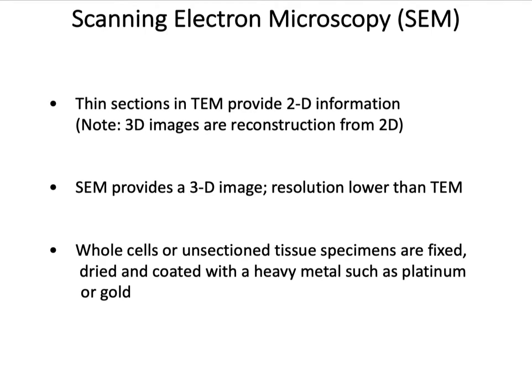As I mentioned before, the cryo-EM technique is capable of visualizing at atomic resolution as well. So transmission EM requires extremely thin sectioning and provides excellent 2D information and detail, but loses 3D information from the specimen. We are not talking about cryo-EM though, just regular TEM. Remember, confocal microscopy solved that problem with fluorescence microscopy. The solution for that problem for transmission electron microscopy is a different kind of electron microscopy known as scanning electron microscopy. It does not require the sectioning of your specimen and will provide a 3D image and information of the three-dimensional characteristics of the sample.